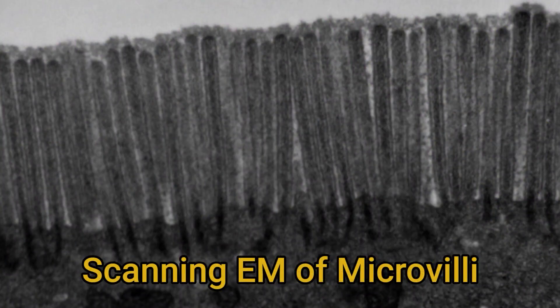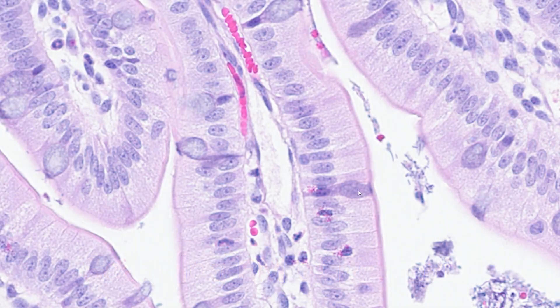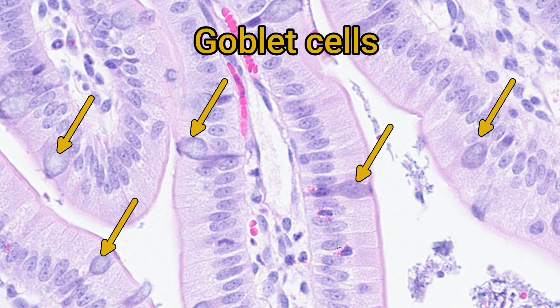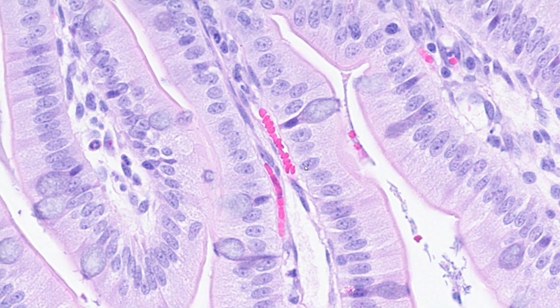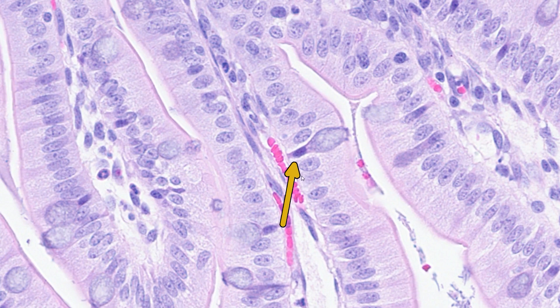The function of the brush border is to increase the surface area of the cell membrane so as much digestion and absorption can take place as possible. The other common cell type is the goblet cell. These are mucus-producing cells, identified because much of the cytoplasm is taken up by a slightly clearer bluish vacuole full of mucus. Below the vacuole there is a thin stem-like area going down to the nucleus, just like a wine glass or goblet — hence the cell's name.